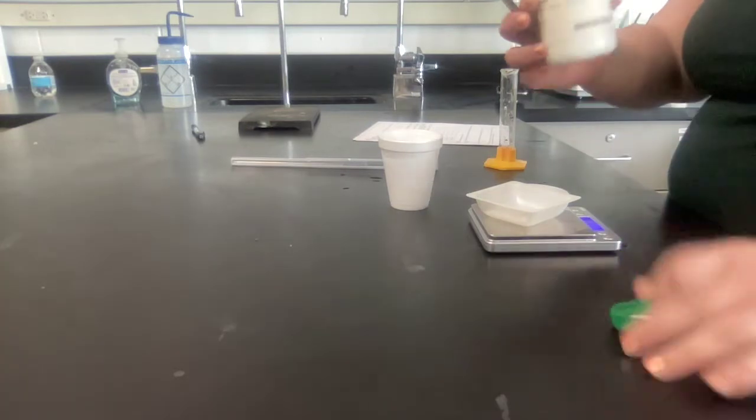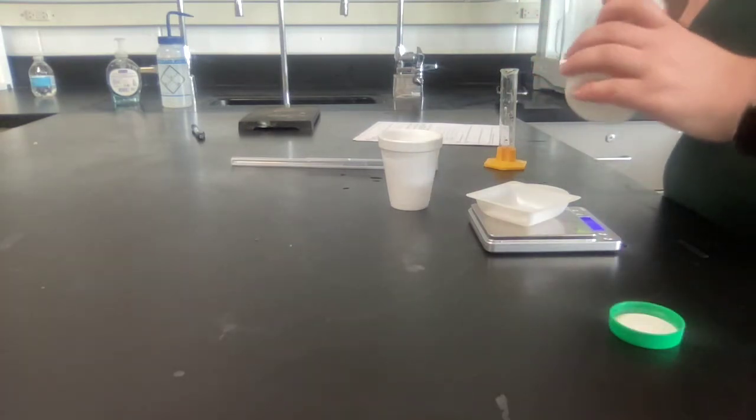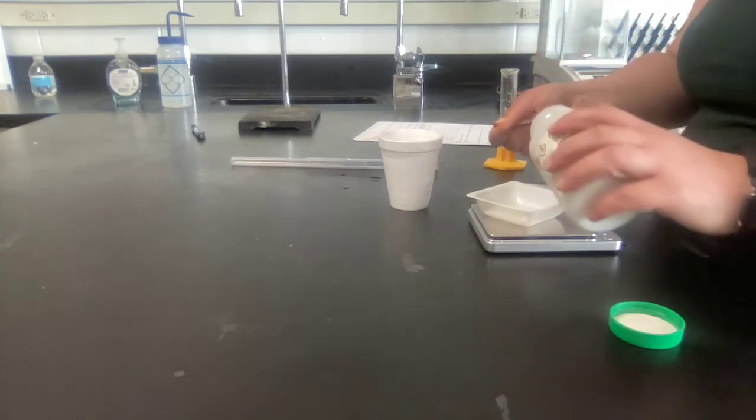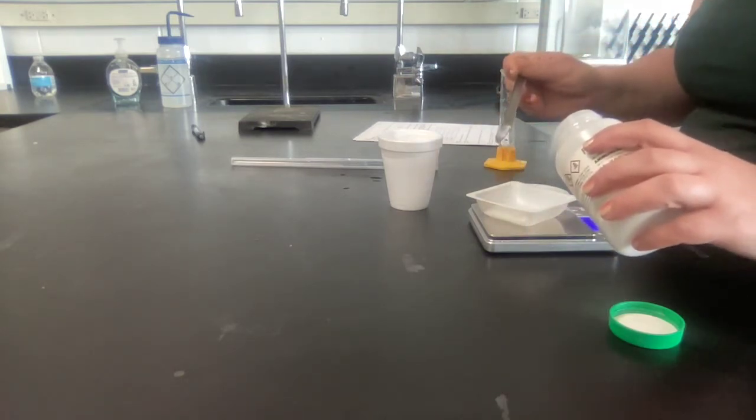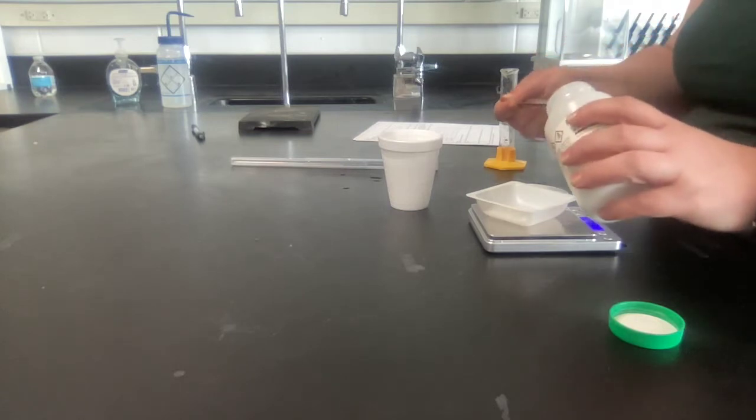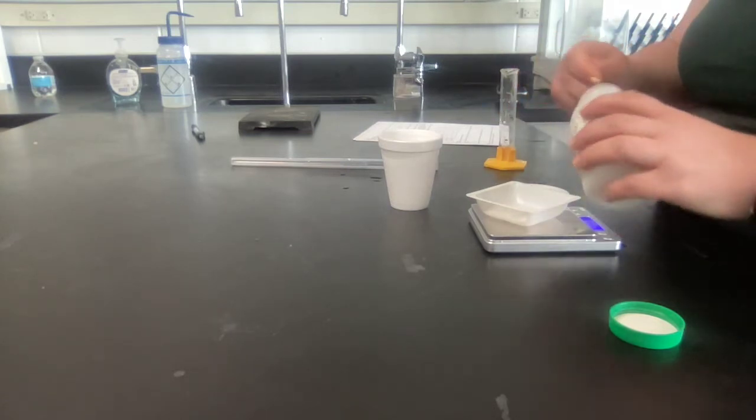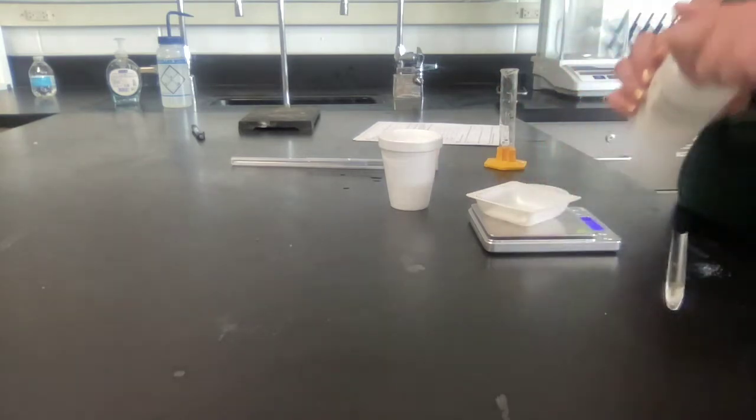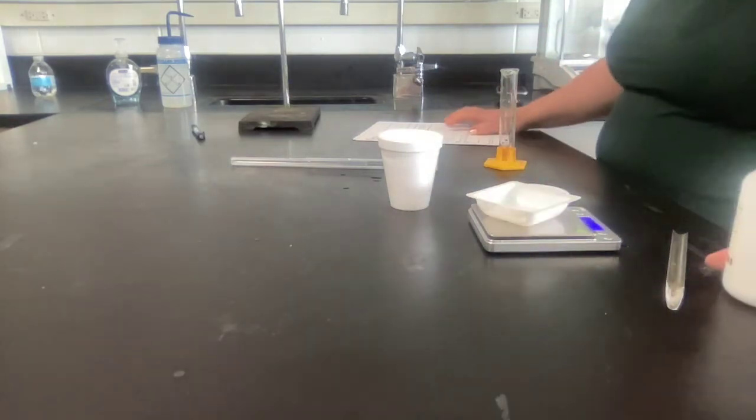Get your ammonium chloride from the front. You can actually probably do this at the front. You're going to do between 1.5 and 2.5 grams. Write down your exact mass. Mine's 1.93, so write down the exact mass.